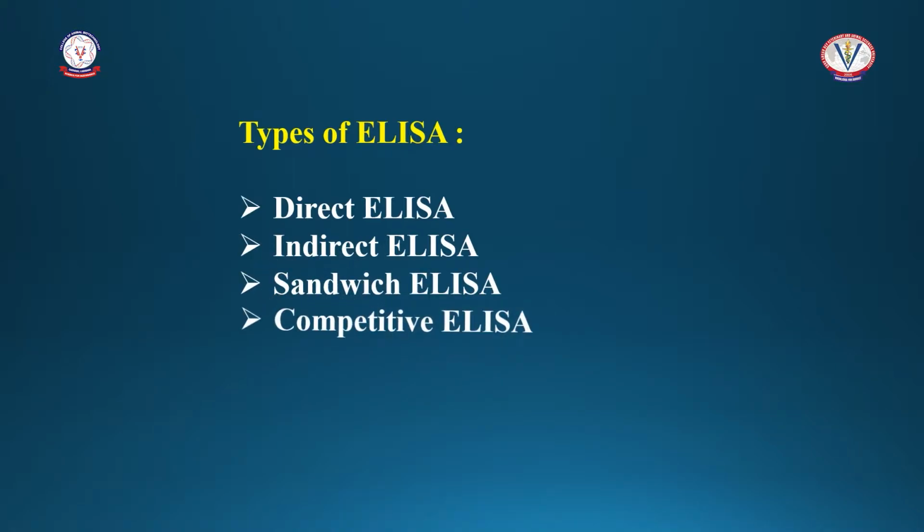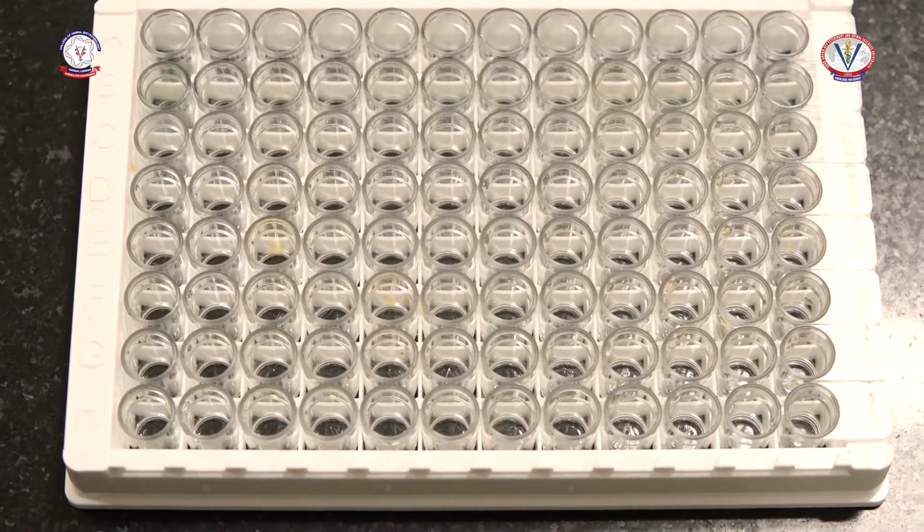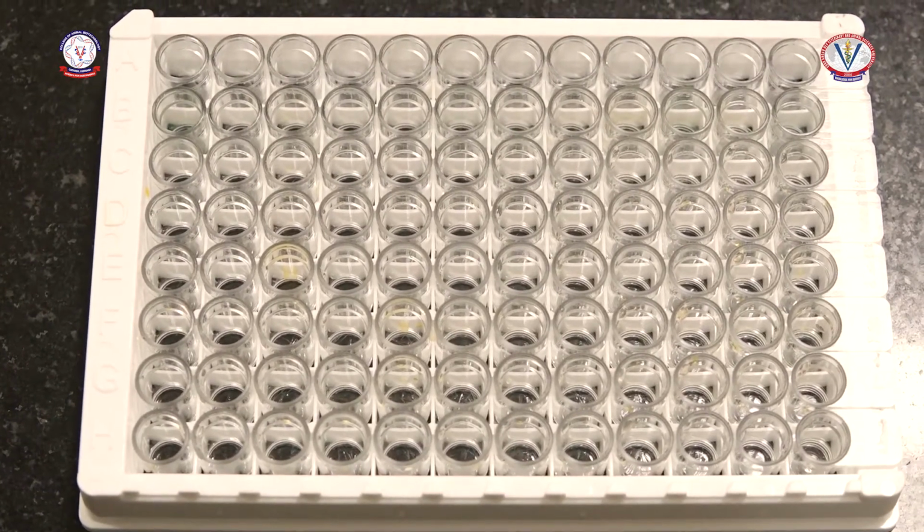In sandwich ELISA, an antibody to a target protein is immobilized on the surface of microplate wells and incubated first with the target protein and then with another target protein specific antibody which is labeled with an enzyme. Compared to direct ELISA, the sandwich ELISA, which combines antibodies to two different epitopes on a target protein, has higher specificity. ELISA is typically performed in 96-well polystyrene plates which will passively bind antibodies and proteins.